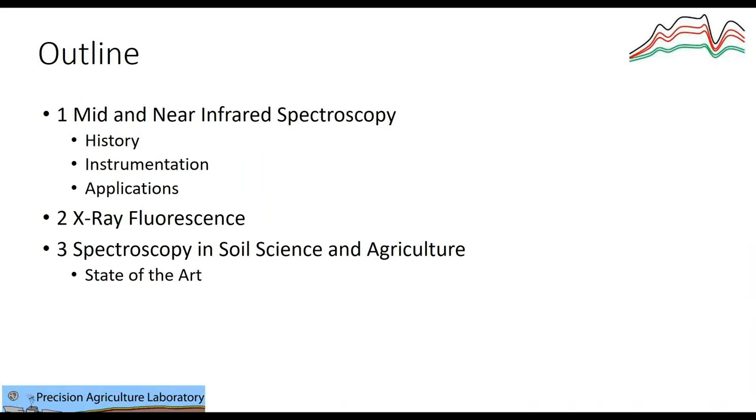So the outline of this brief seminar: I'm going to present some of the history of middle and near infrared spectroscopy. Some of the instruments will be reviewed in this presentation, and mostly it's focused on applications of spectroscopy. I think you can see me here. Yep, excellent. Also, I'm going to present a bit of X-ray fluorescence, you'll see further in the presentation. And as I mentioned before, mainly the presentation will focus on applications of soil spectroscopy in science and in agriculture. All right, let's start.